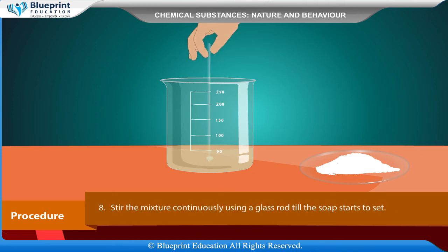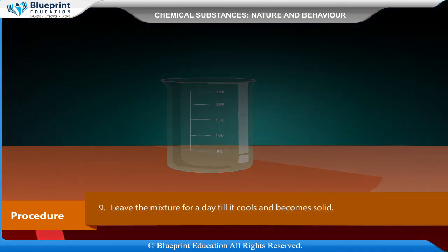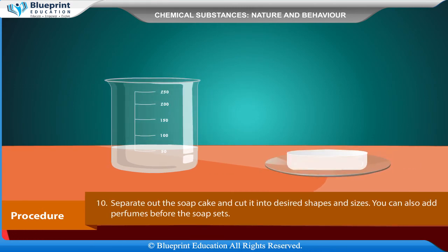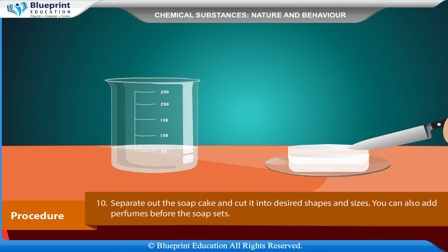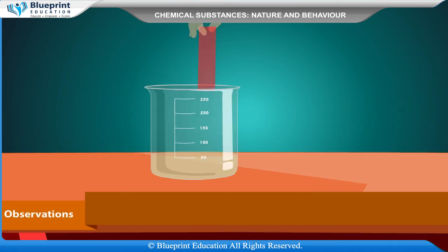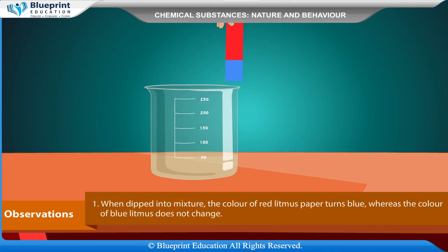Add 5 to 10 grams of common salt to the mixture. Stir the mixture continuously using a glass rod until the soap starts to set. Leave the mixture for a day until it cools and becomes solid. Separate out the soap cake and cut it into desired shapes and sizes. You can also add perfumes before the soap sets.